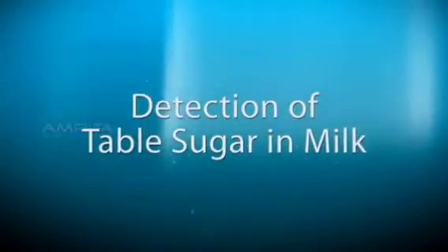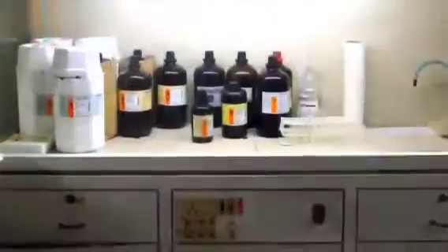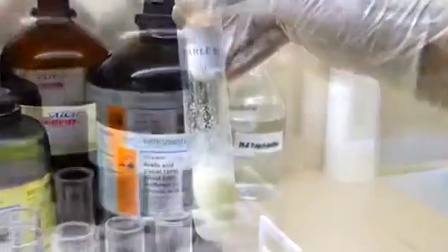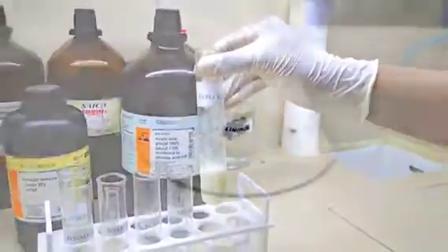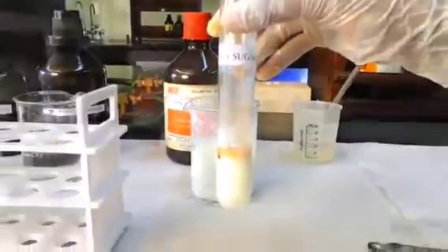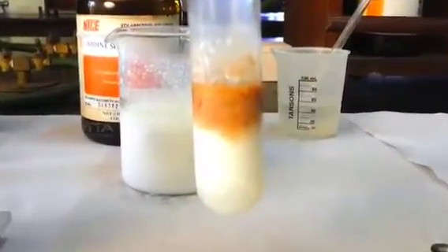Detection of table sugar in milk. Pour 10 ml of milk into the test tube labeled table sugar and using a pipette add concentrated HCl into the tube. That should be done in the fume hood. Now shake the test tube gently so that the milk gets precipitated. Weigh 100 mg of resorcinol, add this to the precipitated milk, then shake the test tube well. The color of the milk solution changes to light brown.